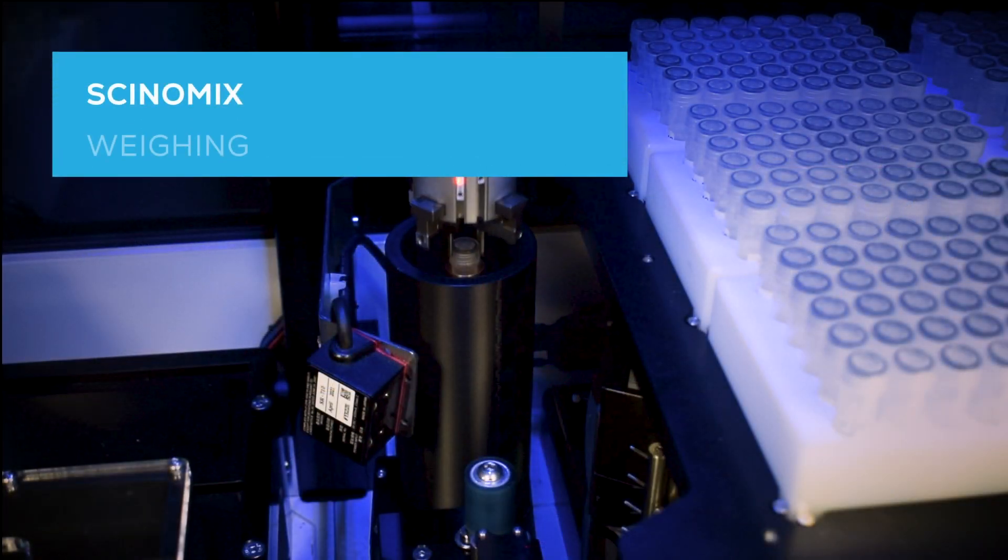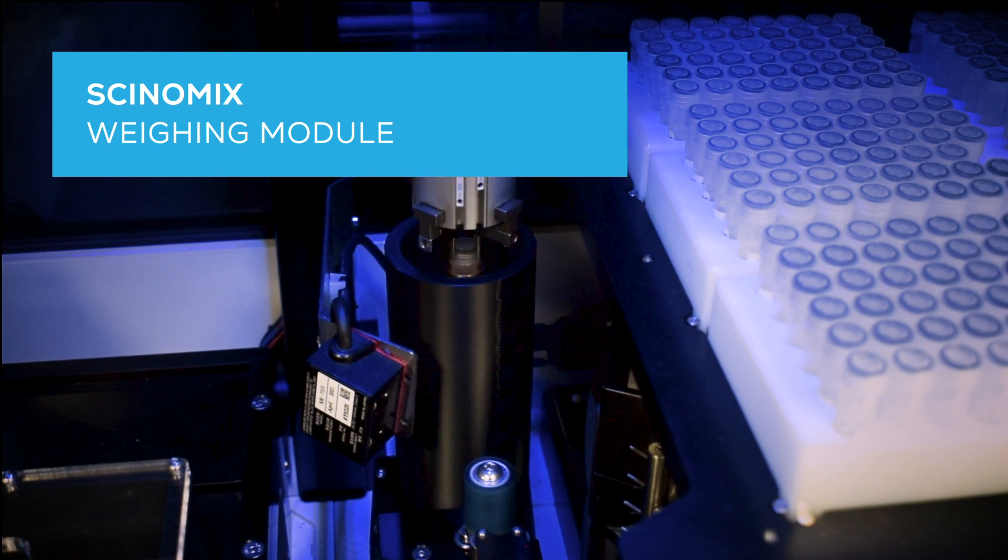Validate your volume dispenses for accuracy and precision with the addition of our onboard weighing module.